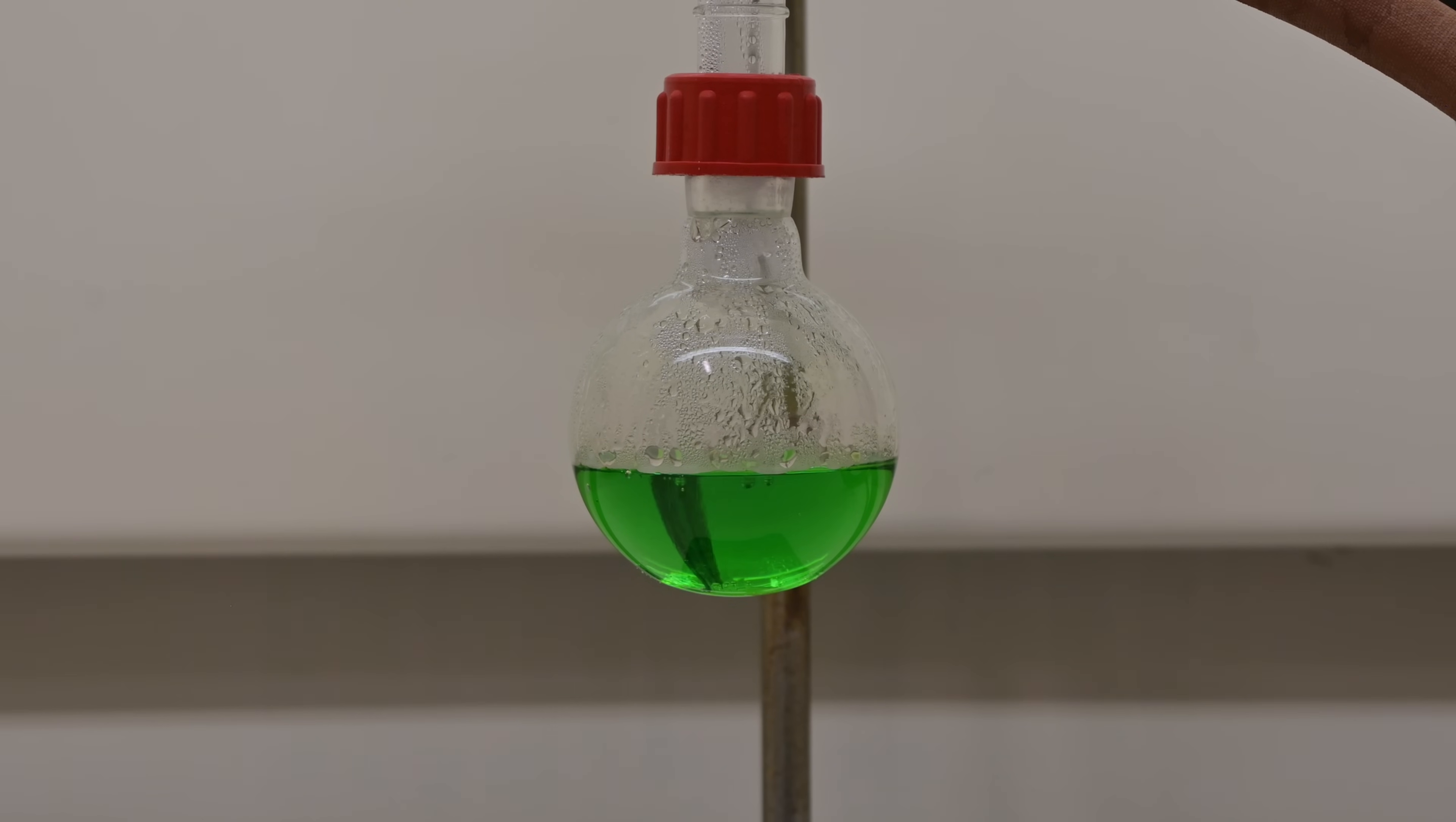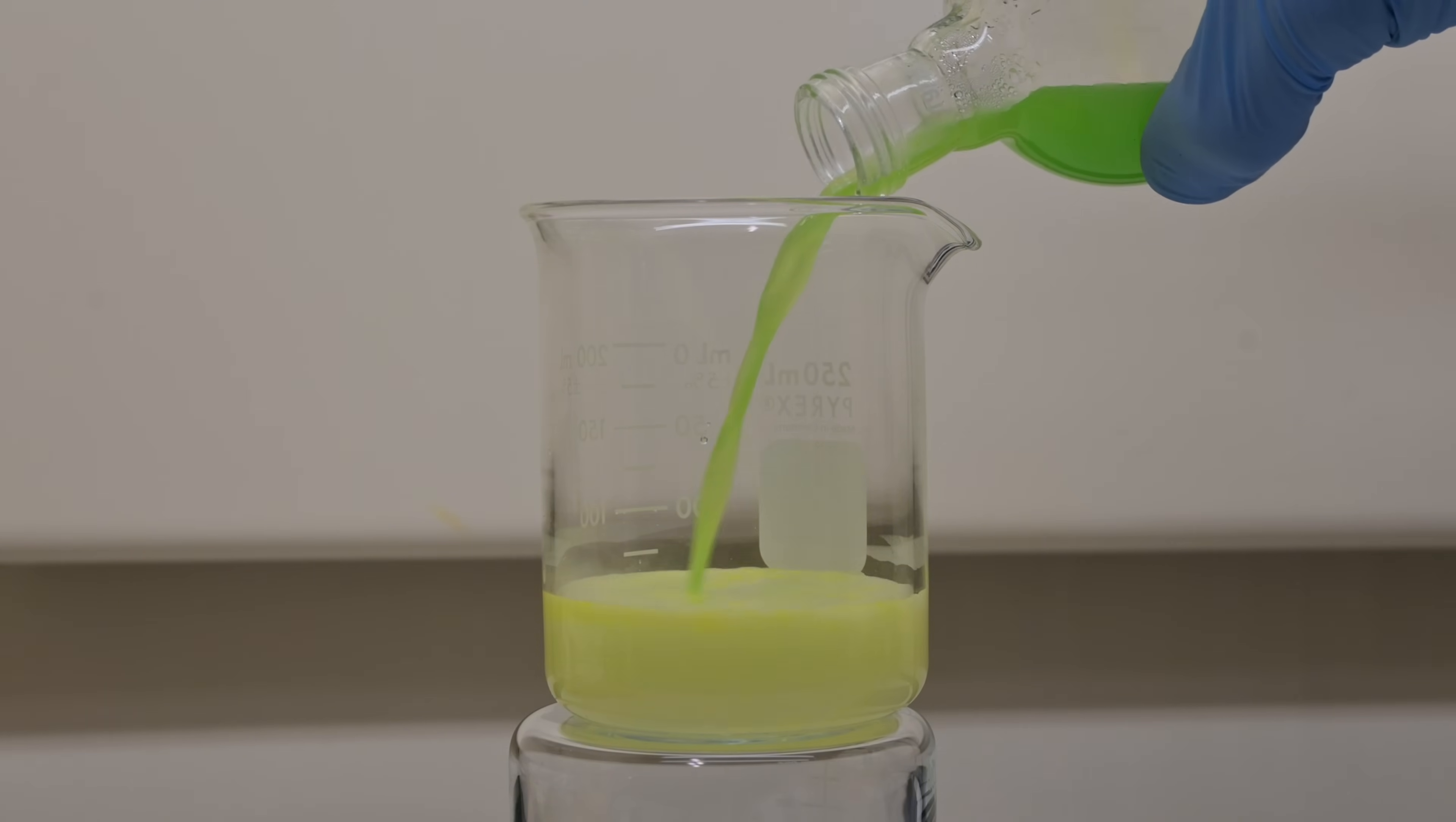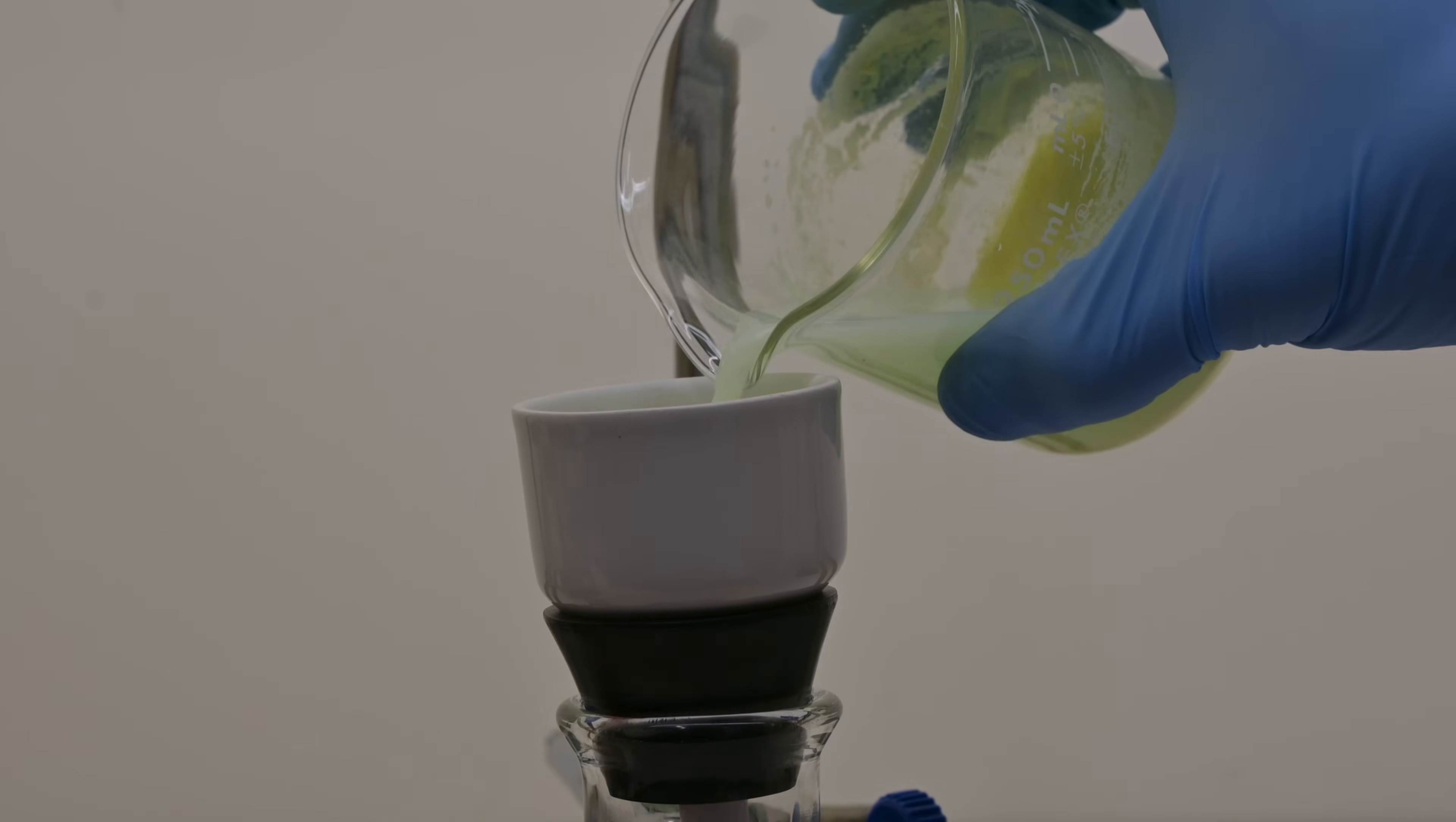After the reaction is complete, we turn off the heating and allow the mixture to cool slightly, ideally to around 50-60 degrees Celsius. Now we pour this warm green solution carefully into 40 milliliters of ice cold water while continuously stirring. This sudden cooling will cause the benzil to crystallize beautifully into vivid yellow crystals, separating from aqueous solution.